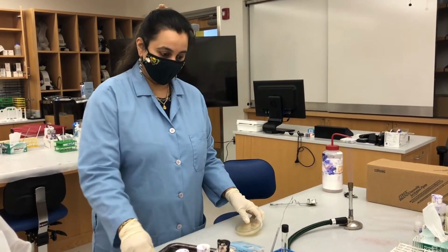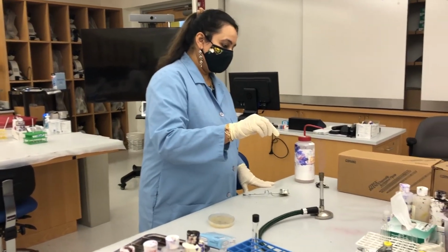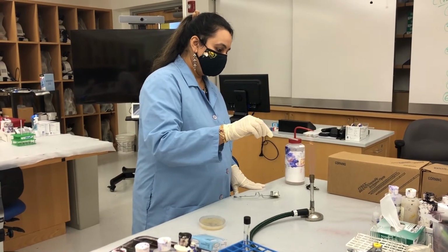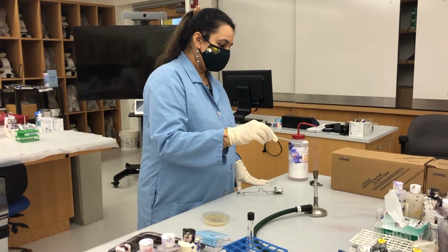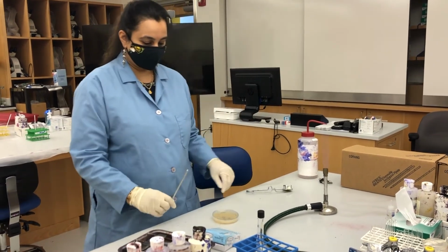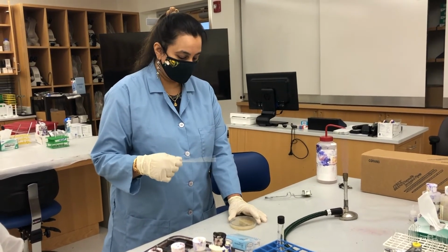Okay, so as always, you have the inoculating loop, flame sterilize it. Wait for it to cool down.